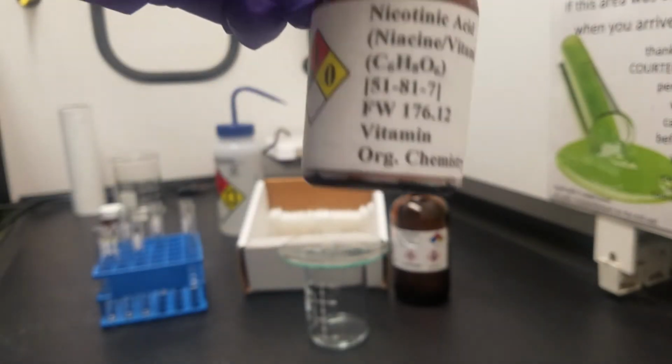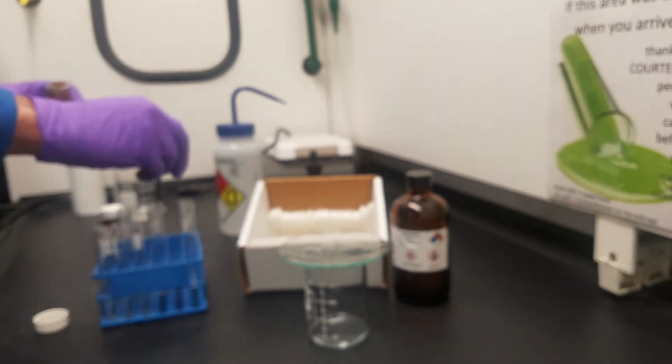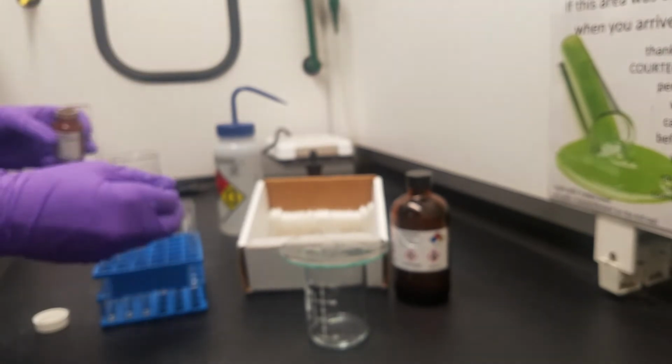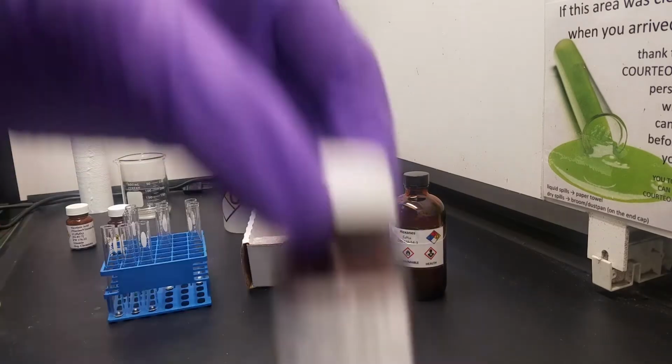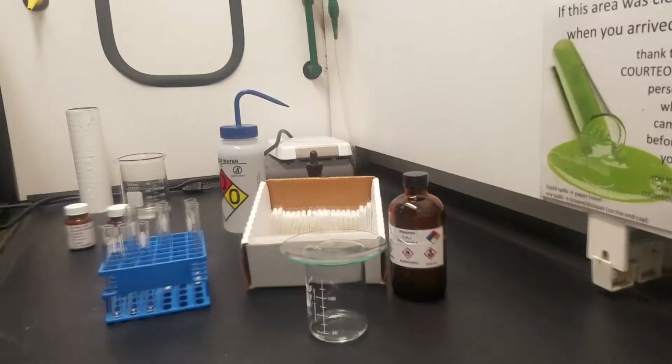So if we look at the top of that test tube, so our extreme right started with ascorbic acid, and I just missed what that next one was, maybe the nicotinic acid, I believe. And then we move to our thiamine hydrochloride. Hopefully we can get it in focus there.